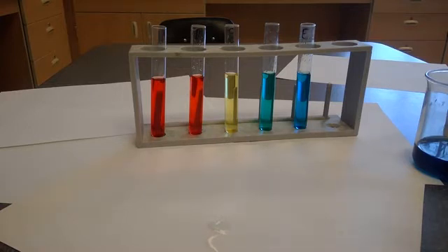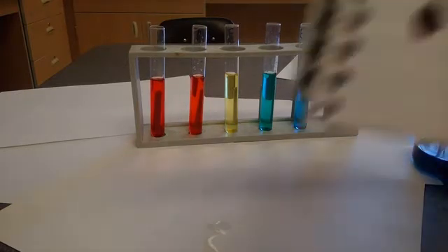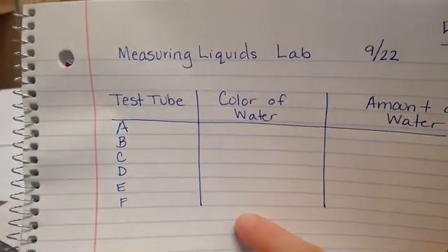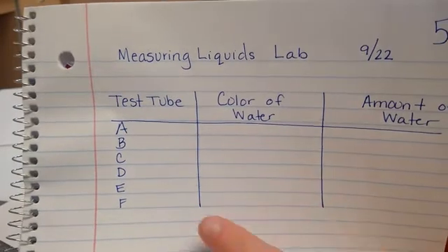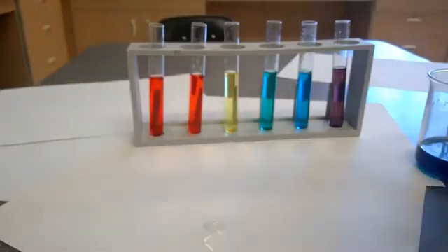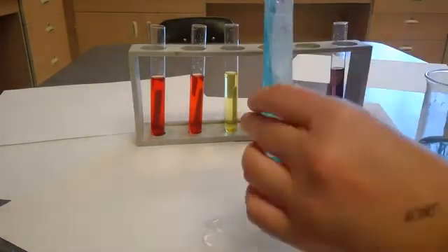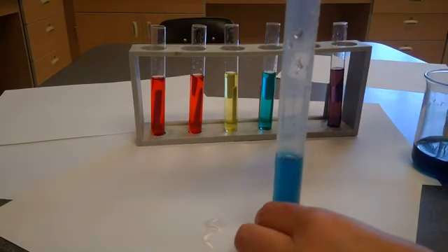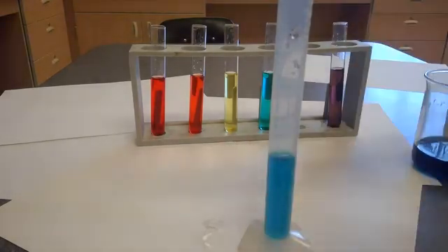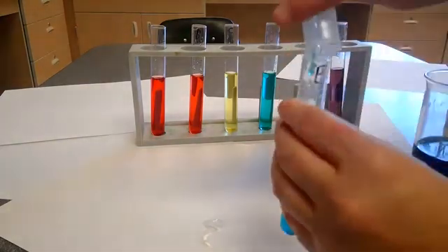So I'm going to go ahead and measure each of these, and I'm going to place those right here. So you should have gone through now that we've finished, and you've got your colors written here, and now our measurements go here. So I started with purple. So right here for purple, I got 12 milliliters. Then I'm going to go on to the blue. And the blue, I got 11 and a half. 11 and a half milliliters of blue.